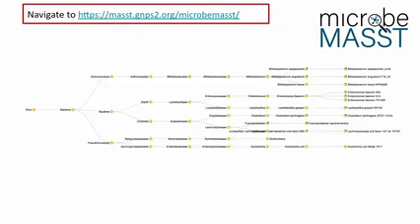And then when you query, let's say, this phenylalanine cholic acid, you're going to get this kind of tree displayed exactly like this. It can tell you, okay, this molecule is found in some Bifidobacteria, Enterococcus, Lactobacillus, and we know that those specific bacteria do have a BSH. The BSH is bile salt hydrolase. We know this gene is able to conjugate phenylalanine to cholic acid. So it makes sense from the biological perspective.